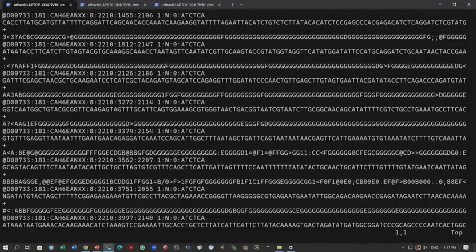So, let us go back to the first line, and one of the things that you might be wondering is whether we can write anything on this file. To do that we have to go into the write mode. Before we go into the write mode, if you are just interested in read mode, for example, with FASTQ files, we do not want to write anything, so we just want to come out of that file.